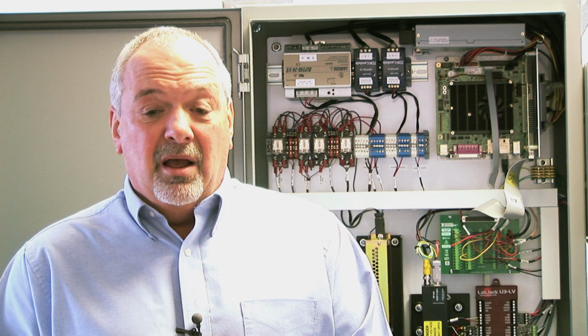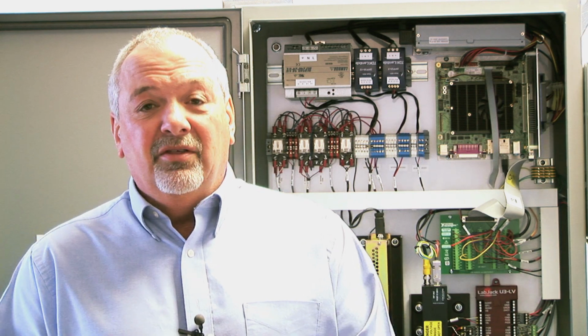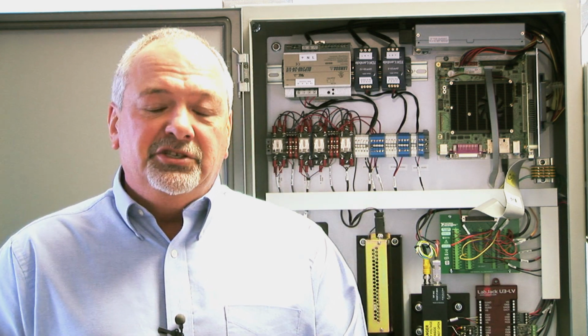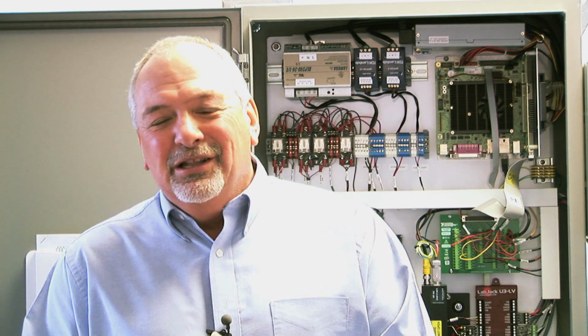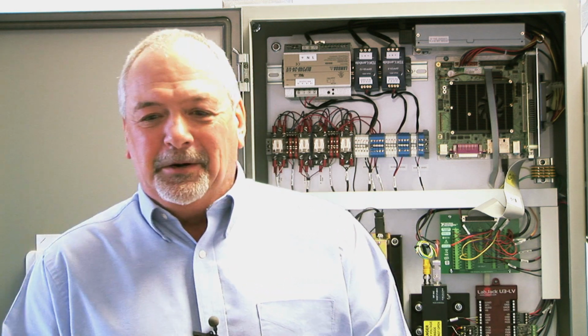Another one I was pretty hesitant to bring up at first because it's pretty non-traditional for anything that we're familiar with in the business, and that is BOD, specifically carbonaceous BOD5. I was hopeful that they wouldn't leave at that point, but they seemed like that was going to be a pretty easy thing to master.